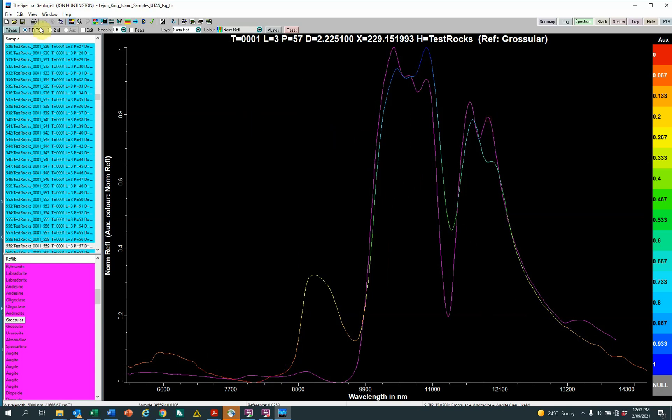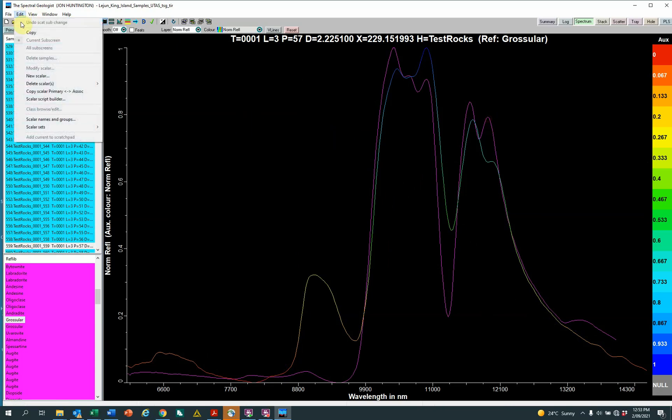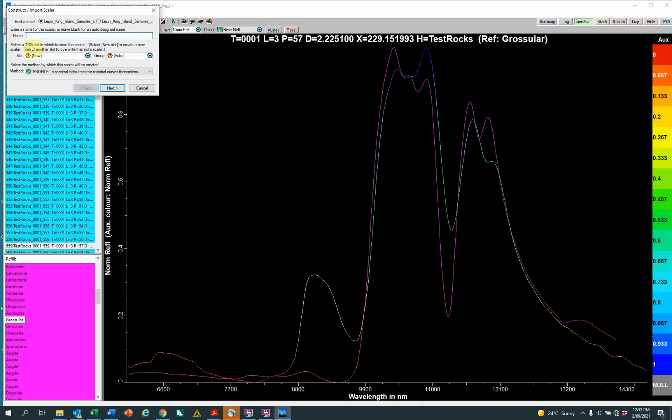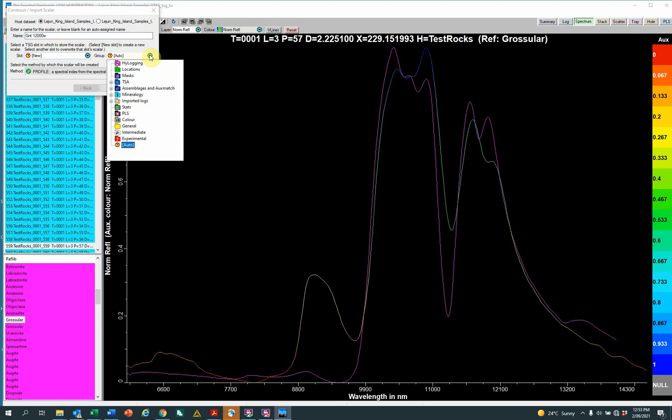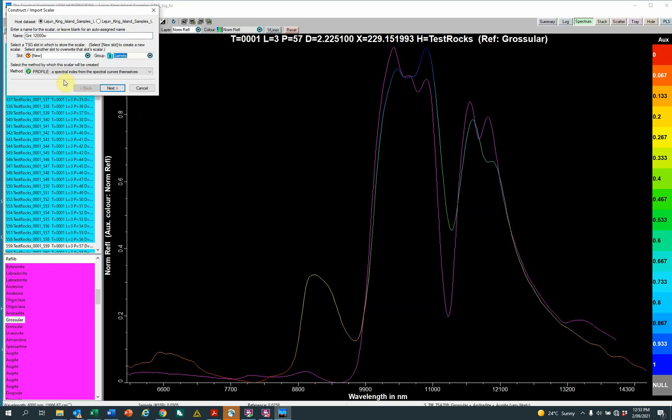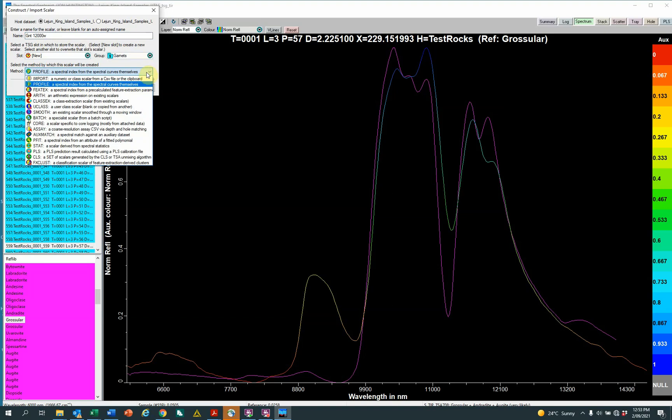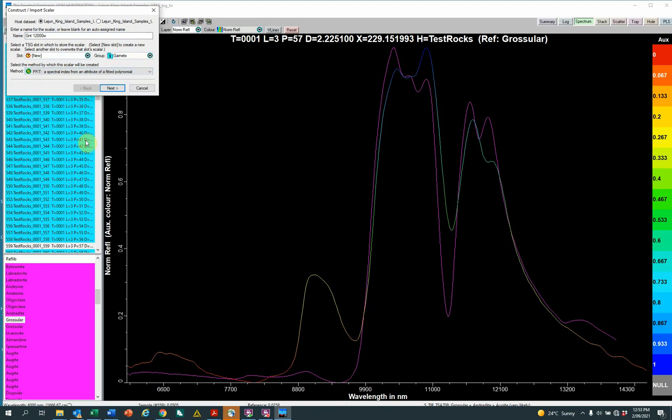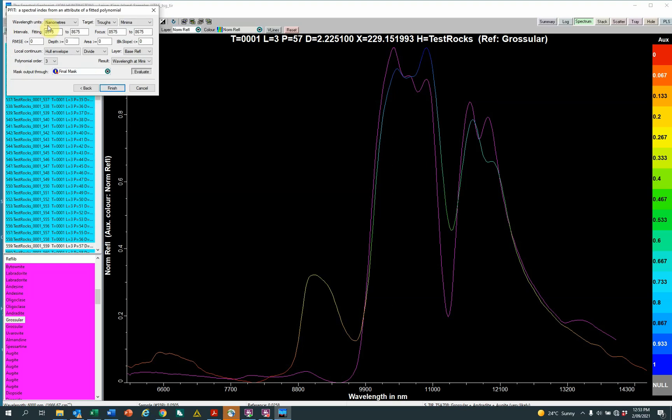How to do it? We make a scalar. So top left here, edit, new scalar, name, I'm going to call it Garnet 12,000 approximately. W for, I'm going to be tracking the wavelength of it. I'm going to put it in mineralogy and look for Garnets. And the method I want to use, there are two methods for extracting wavelength information from the spectra, this one called profile, which is the default, and another one near the bottom called PFIT. And I'll use that. PFIT next. So the wavelength units, nanometers, that sounds correct. I'm looking for a peak, not a trough. So we'll change that to peak. With the interval that I want to fit a polynomial to, that then I can extract the wavelength from, that's what I want to do next.